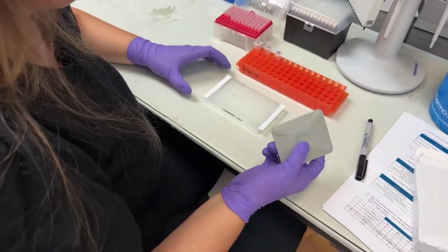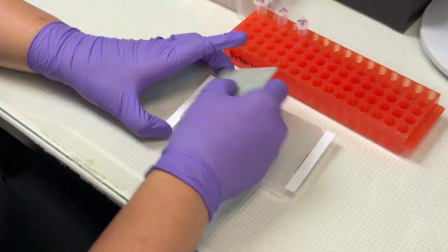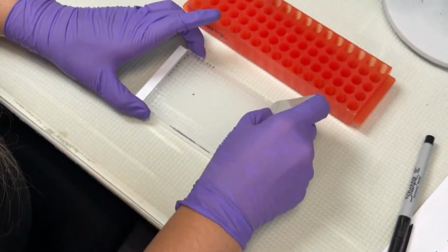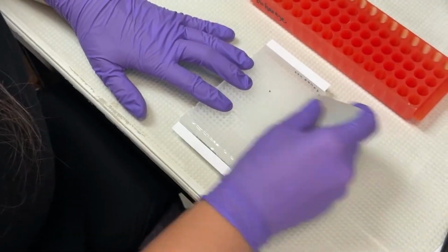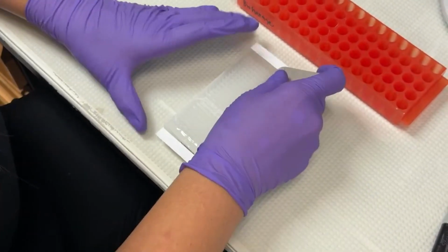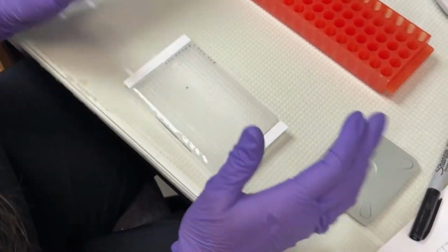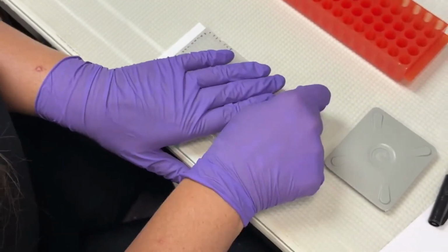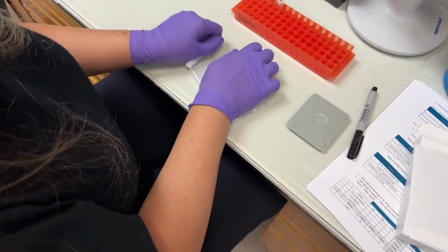I have a paddle, and I'm going to go from the center out, both directions, and I'm going to do it again horizontally. All right, should be pretty well stuck. I'm going to take the fins off. It's perforated, so just snap those off.